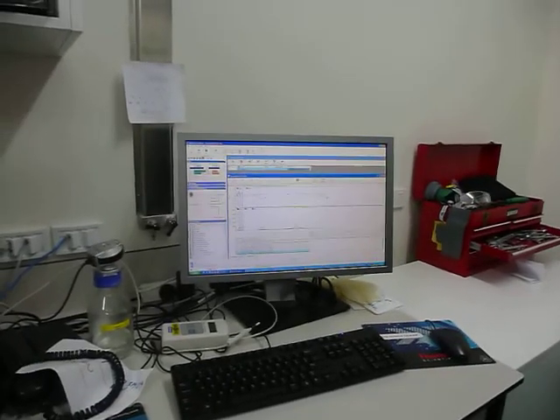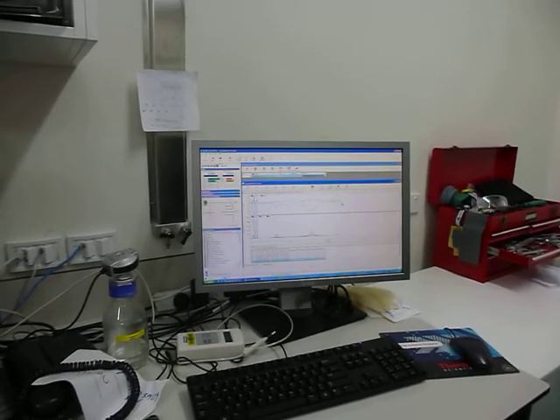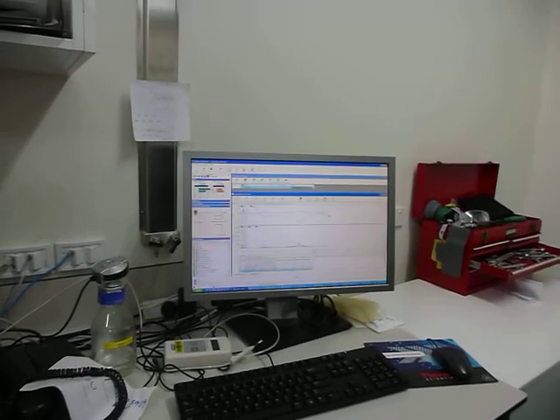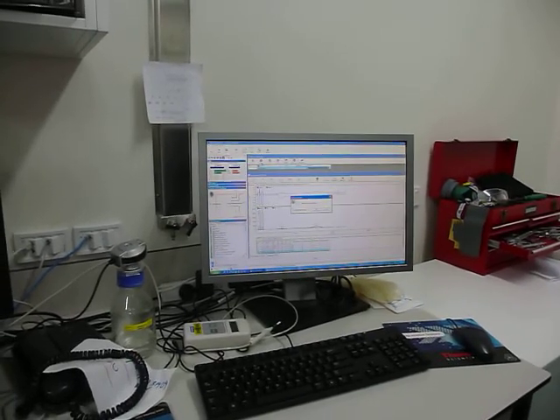As I showed, there are three different devices that are being controlled here. The stable isotope mass spectrometer, we call it IRMS, so from now on I'll call it IRMS. The TOC analyzer and the robotic arm. The robotic arm is an autosampler. The robotic arm was very cheap. It was $89.